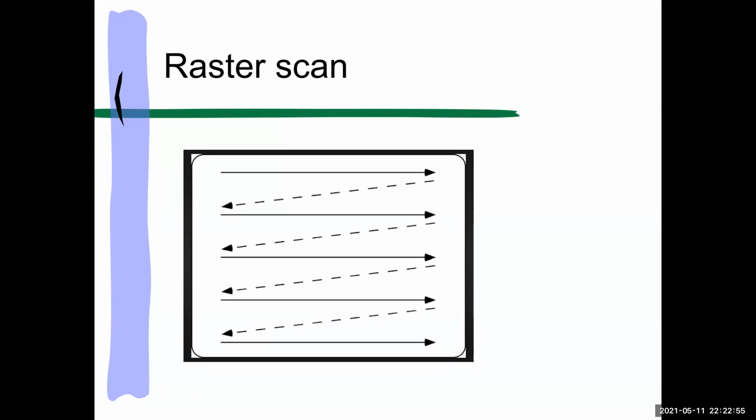I mean, new confocals are so fast. They're brighter, they're better in all sorts of ways. They've got solid state lasers. I used to have to turn on different computers and use different operating systems just to see the image. Nowadays, you just see it as it's being collected, it's immediate.